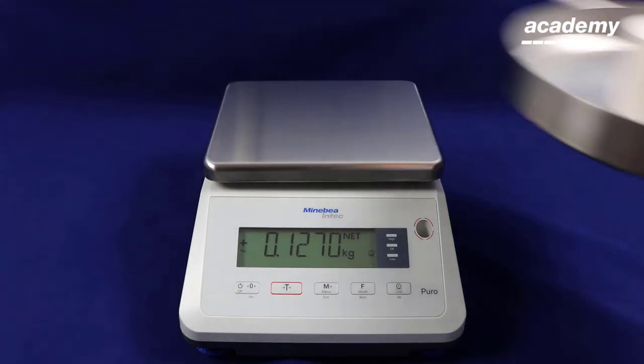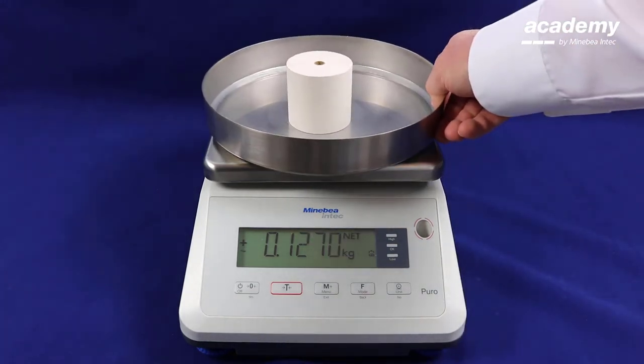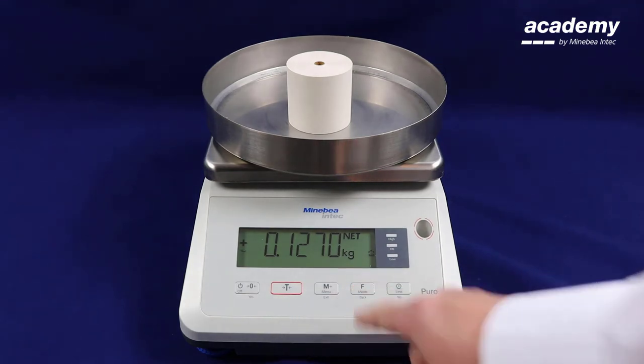Now you can remove the container and the sample off of the scale, and the weight will remain. Press the function key to unlock.